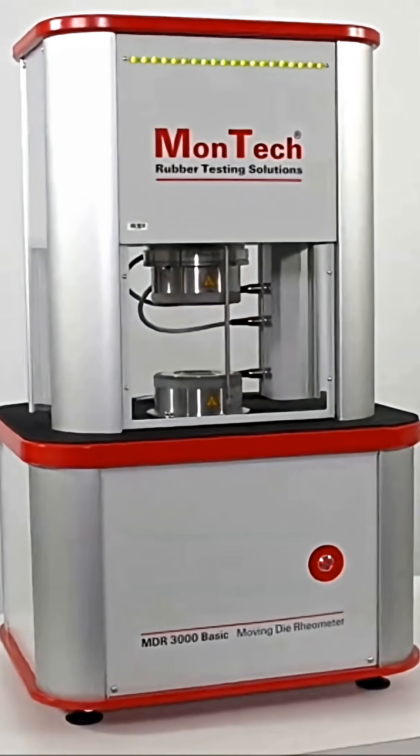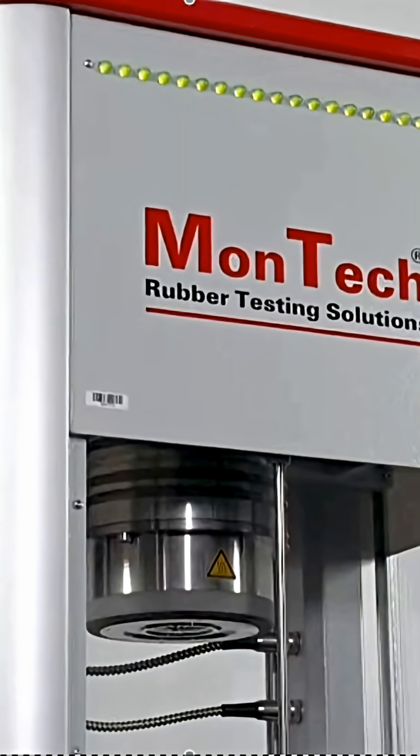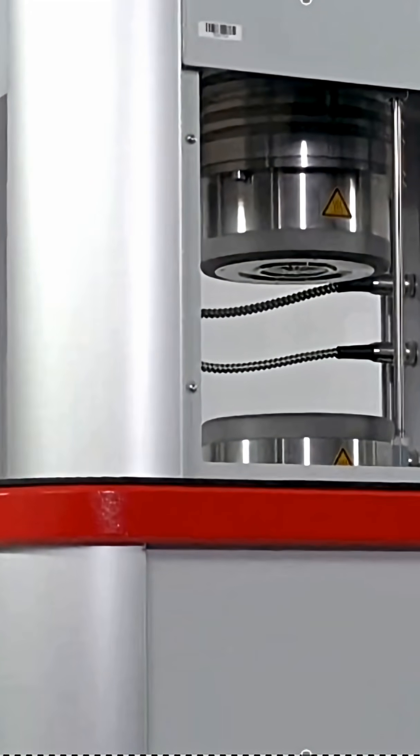The MDR stands for Moving Die Rheometer. It's one of the most common instruments in a rubber lab, and it gives us a cure curve — torque versus time as rubber vulcanizes under heat.